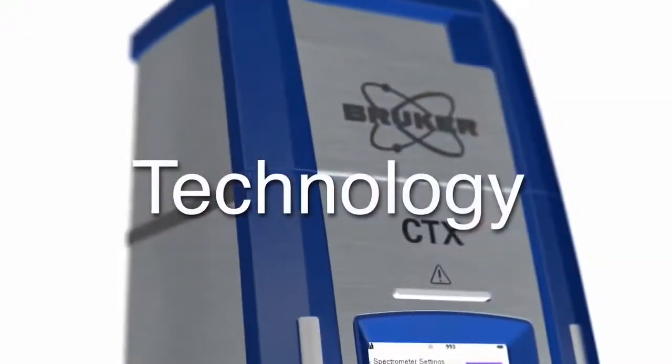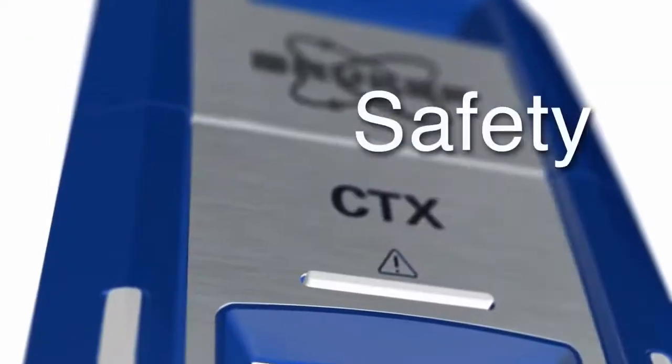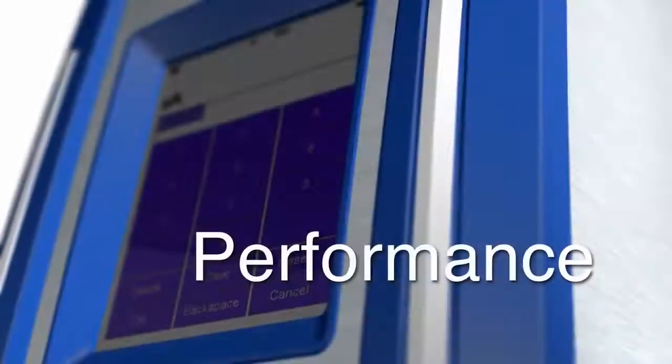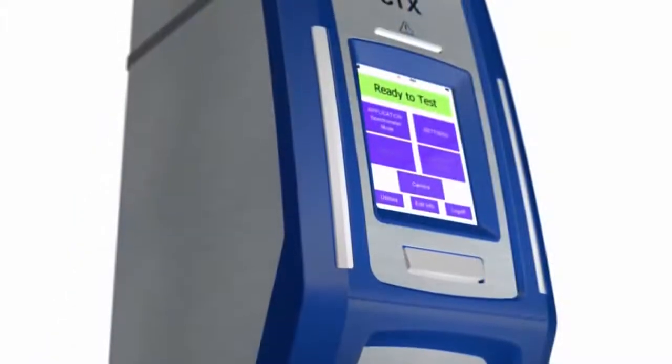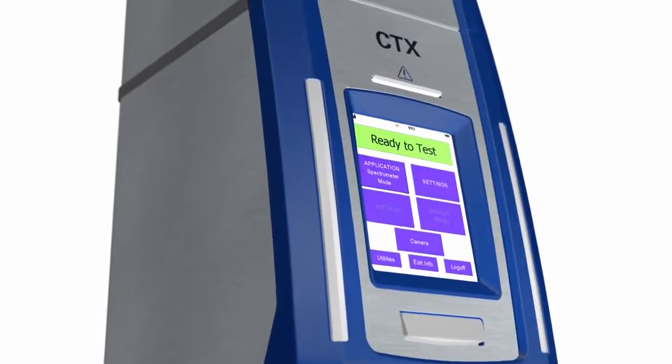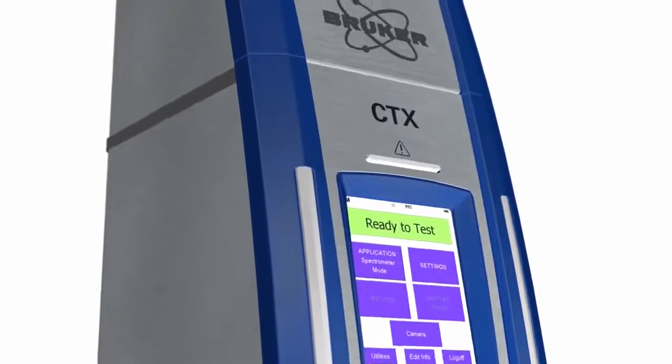The CTX is designed with the technology, safety design, and performance you have come to expect in analytical instruments from Bruker. The CTX incorporates all the portable XRF features you would expect for handheld XRF but in a self-contained safety interlocked portable unit.